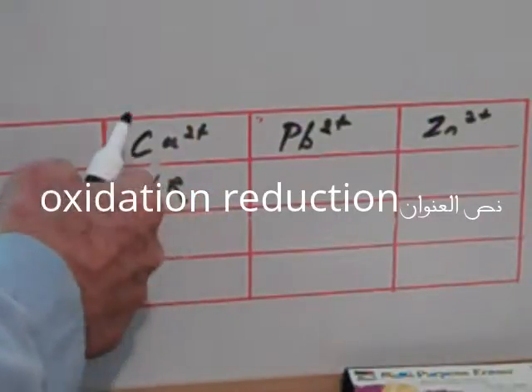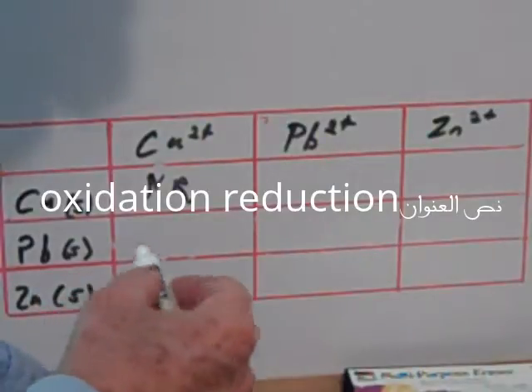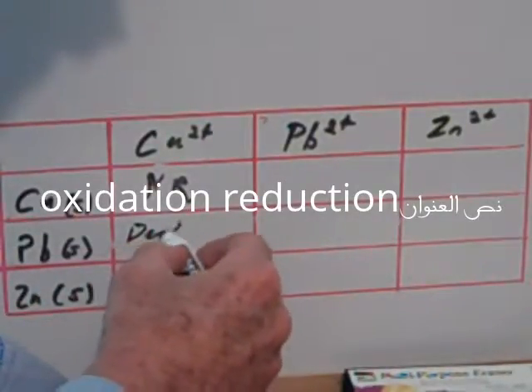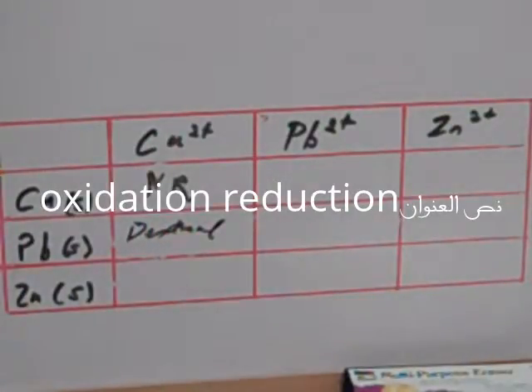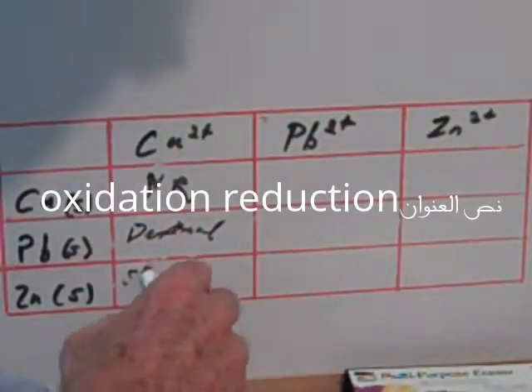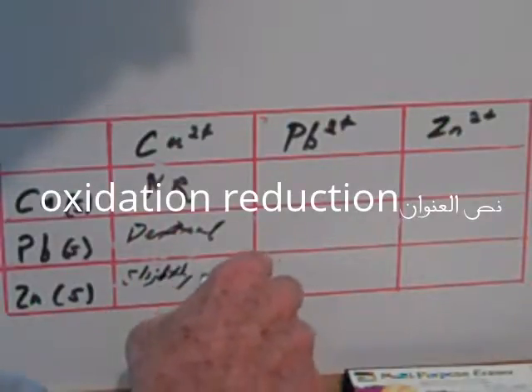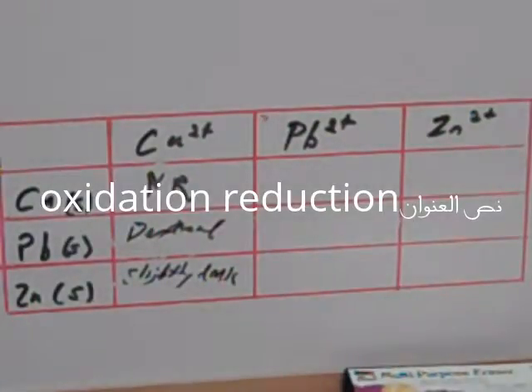Can't write in this position. The lead darkened. Darkened. So the lead has reacted here, and it's been oxidized. And the zinc—slight change, slightly dark. Okay, hard to read that I imagine. Let's take a look at the lead nitrate samples. See what they look like.